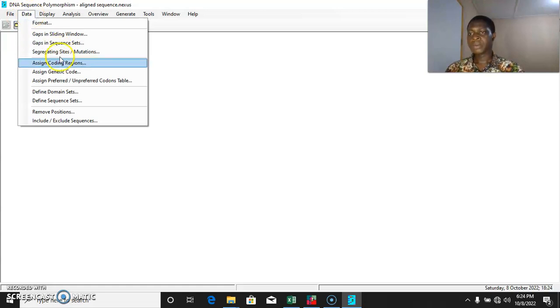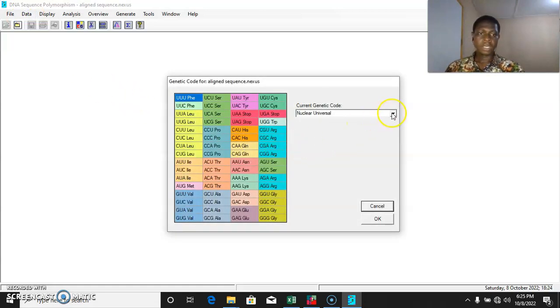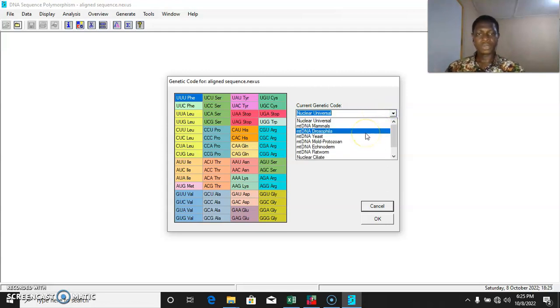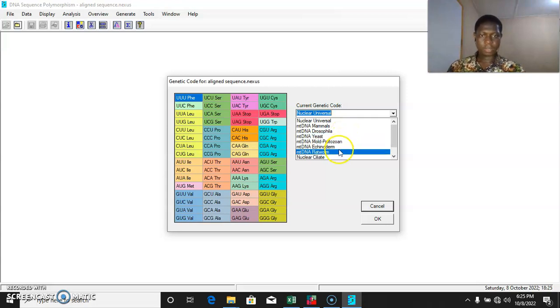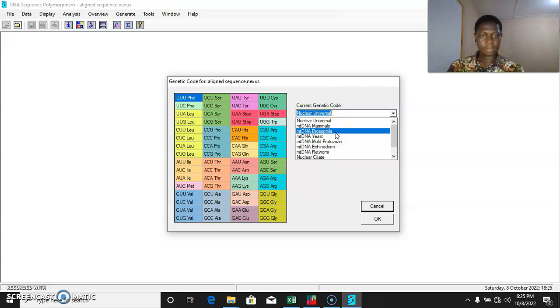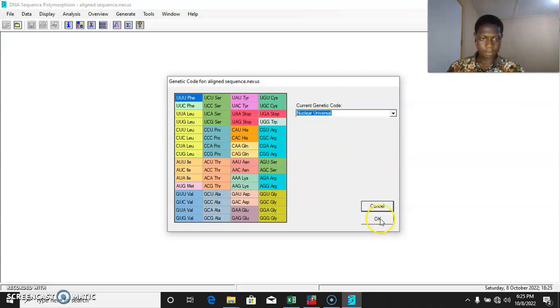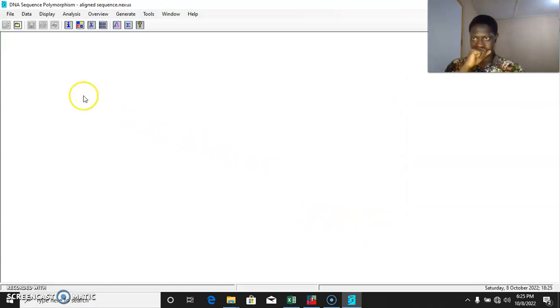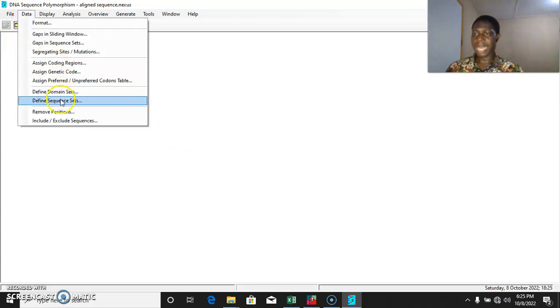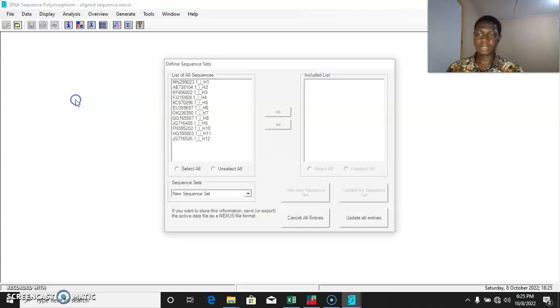The next thing we might want to do is to assign a genetic code. If you're sure of the source of your sequence — whether it's from Drosophila, yeast, or flatworm — you can select that. But for this example we'll be using the Nuclear Universal. Once we are done with that, we'll assign a defined sequence set.